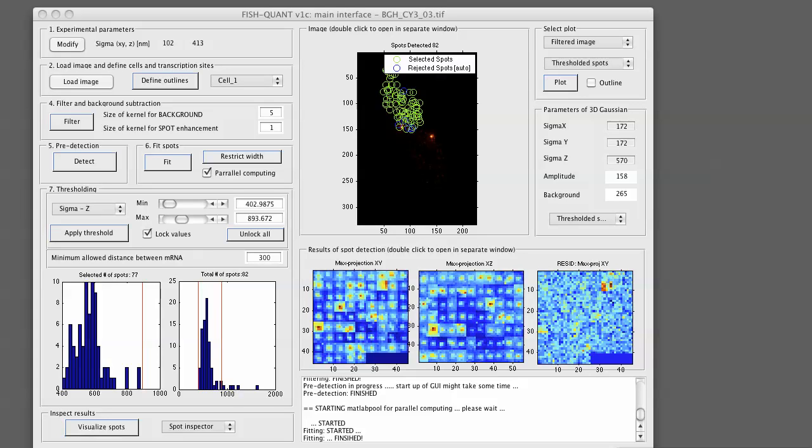Hi this is Florian. In this video I would like to show you how you can perform the mature mRNA counting in FishQuant in a batch mode. This means that you can process a number of files together without being forced to do it manually.